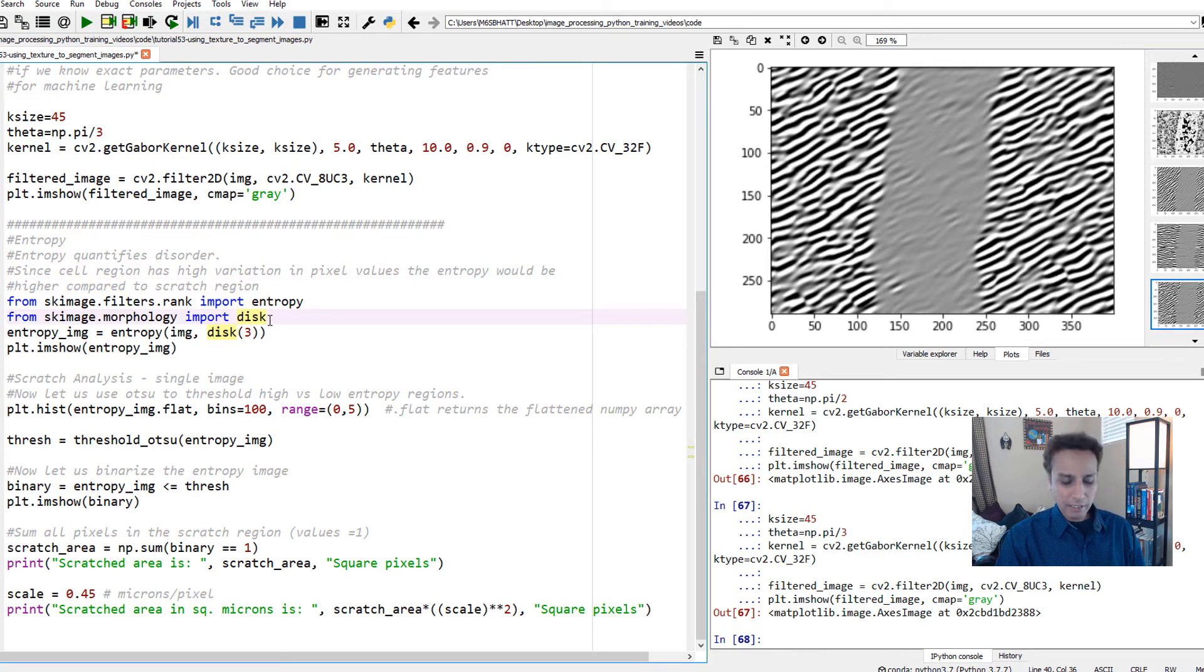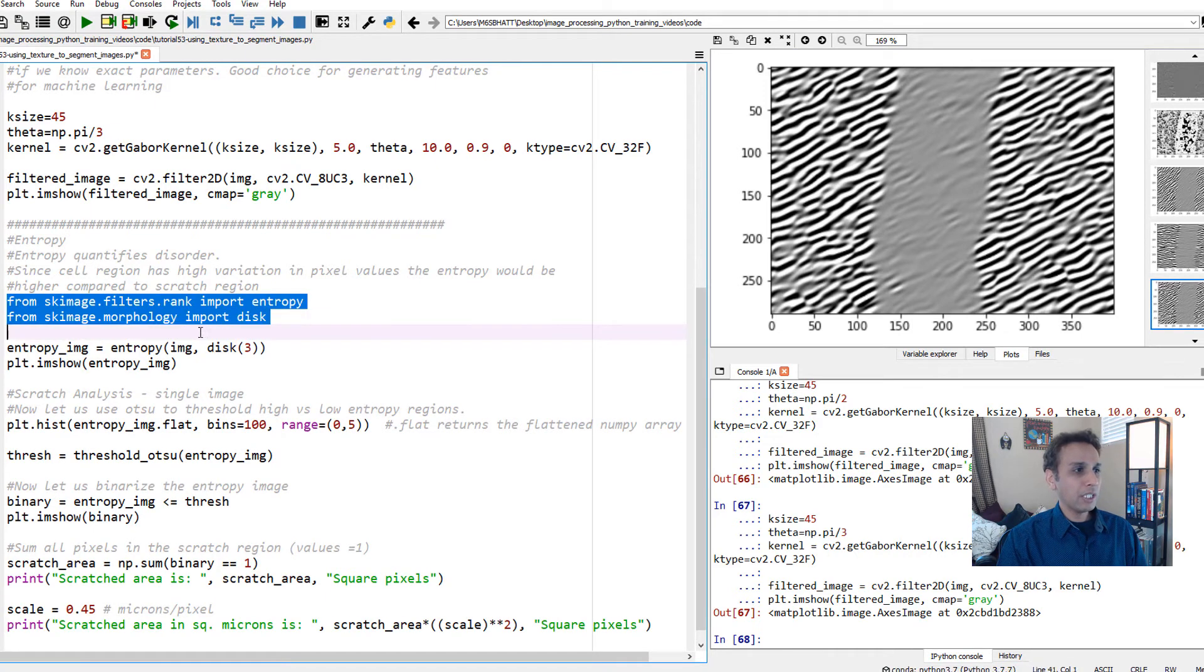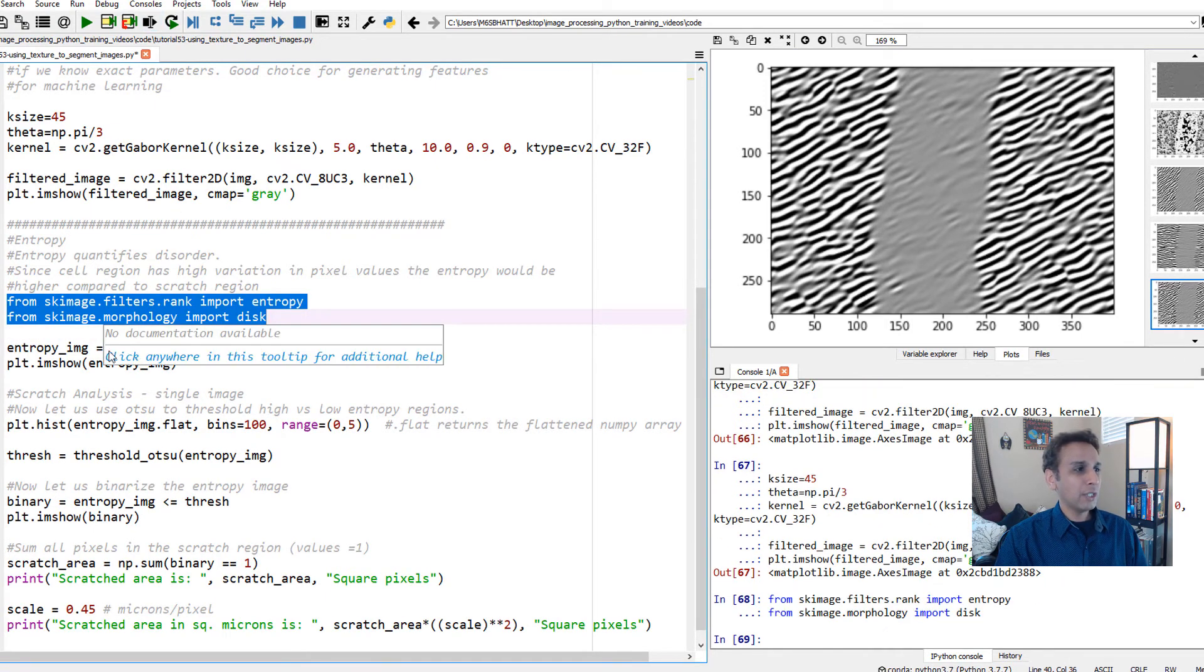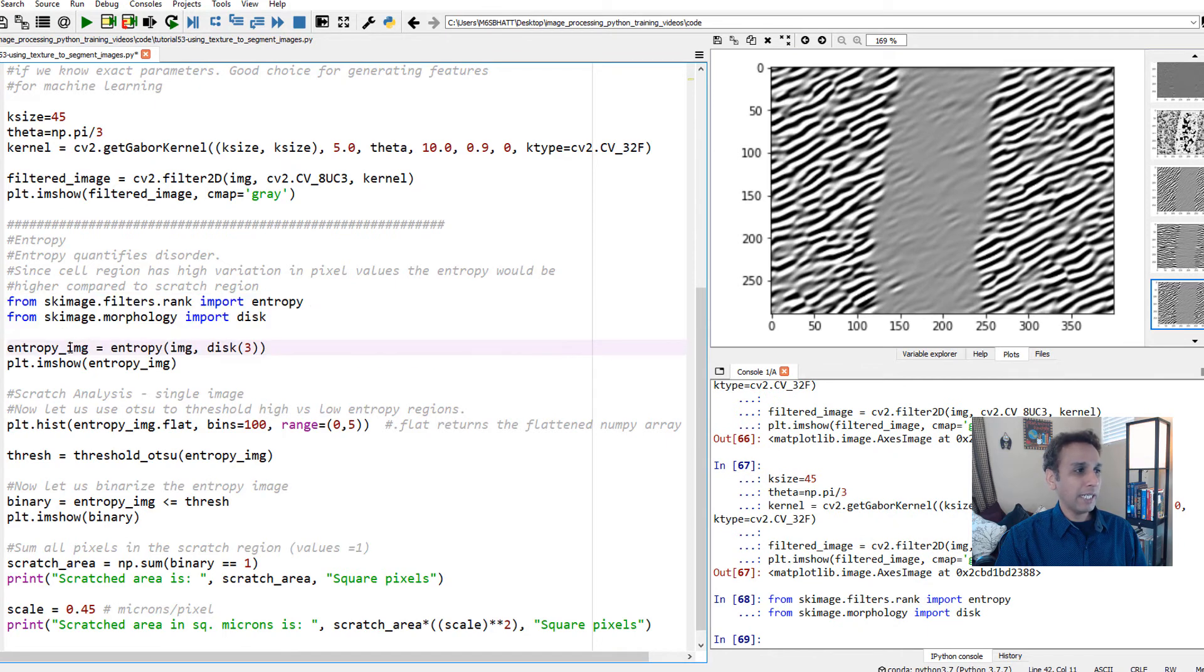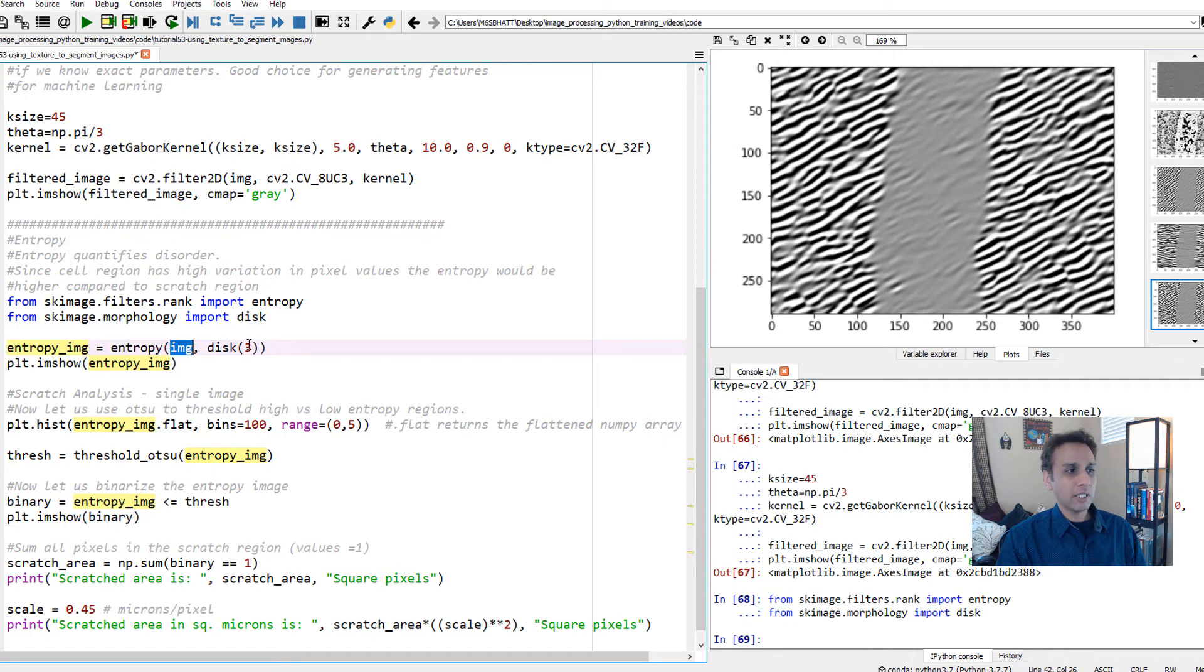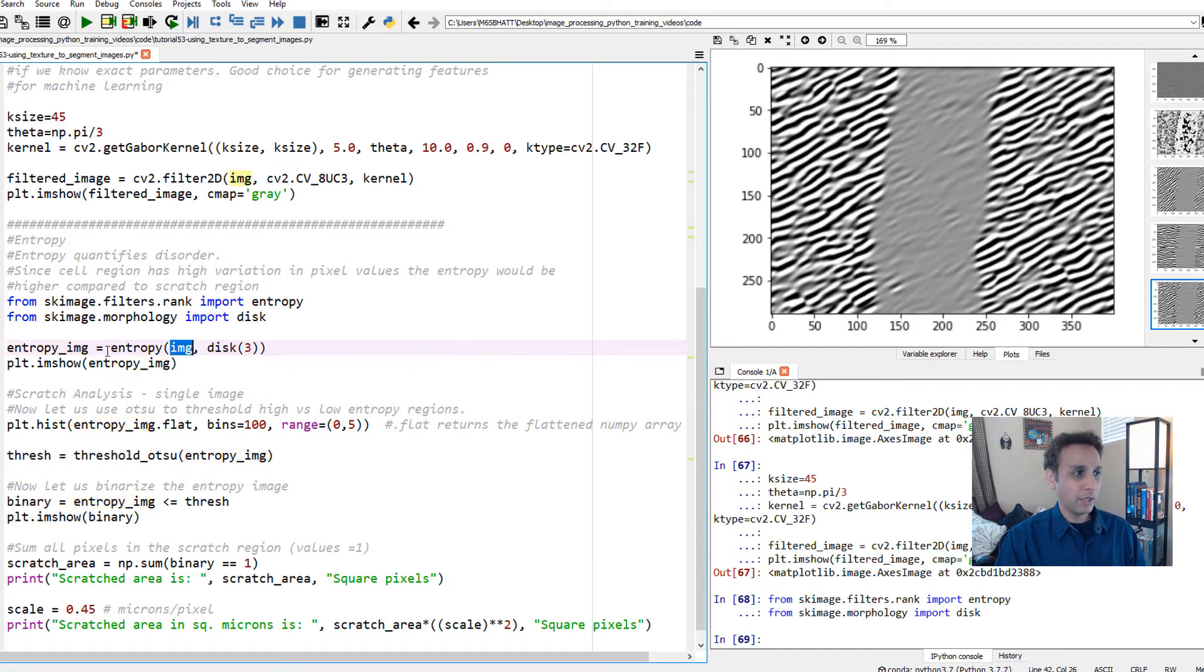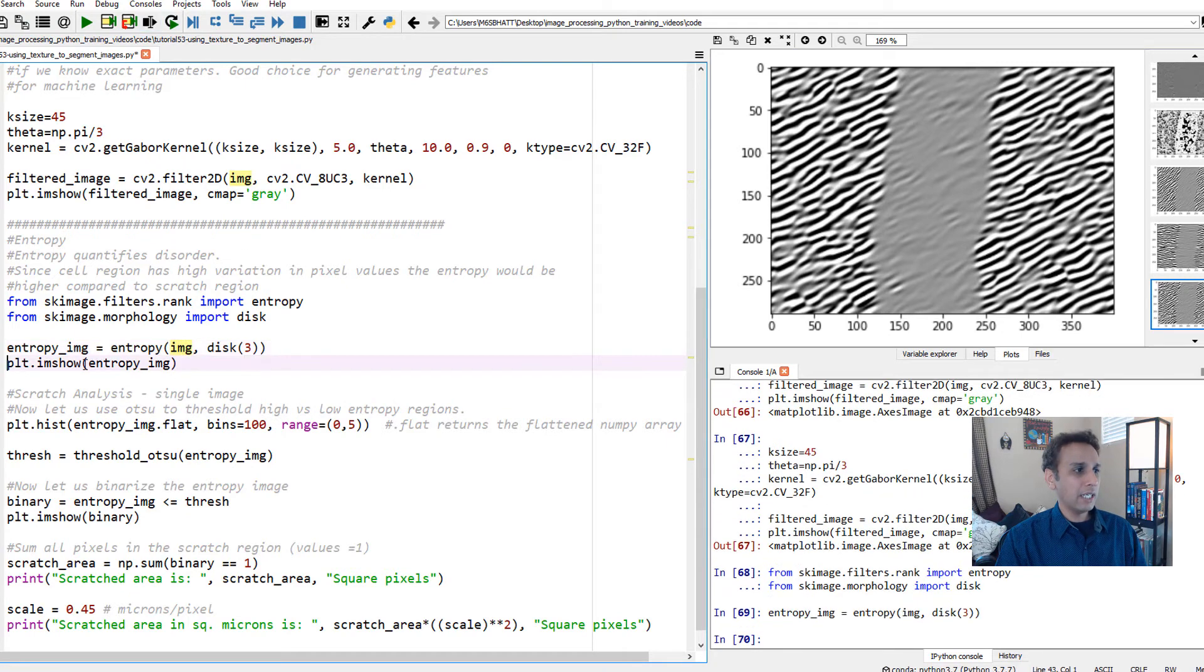How do you apply it? Very simple. Bulk of the work, someone else did it and provided the library. Once you import these two, we just need to generate an entropy image by applying this entropy onto our image with a disk size of 3. You can change the disk size to see how it affects your image. Let's apply the entropy.